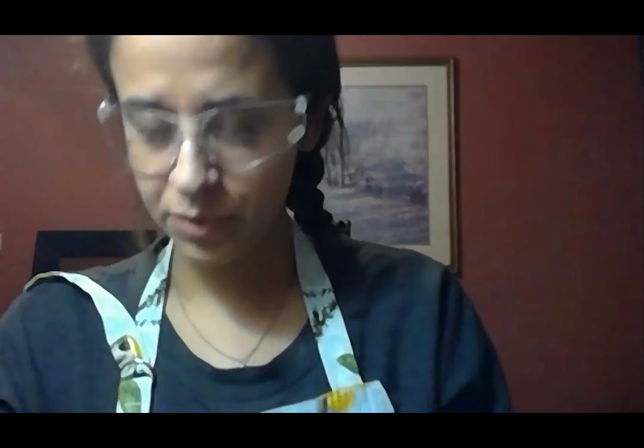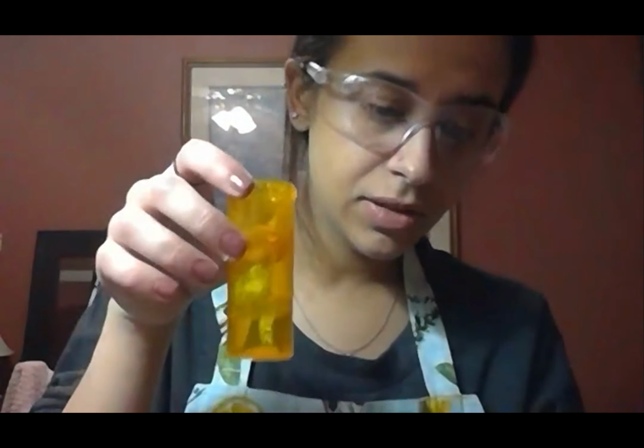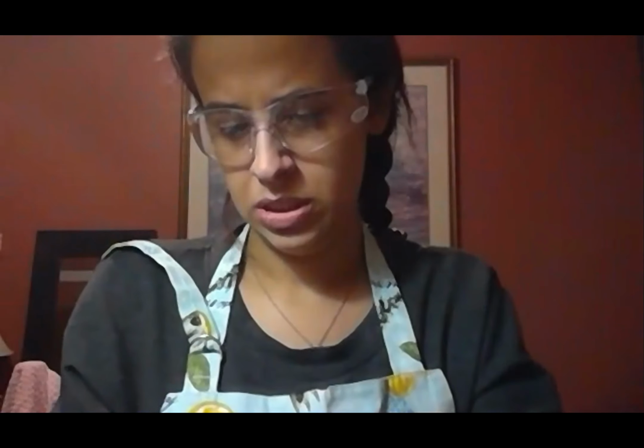So I'm going to restart this. Add 15 more milliliters of our water. Okay, so this one is test D. So now we're going to do our stirring. So I'm going to start.